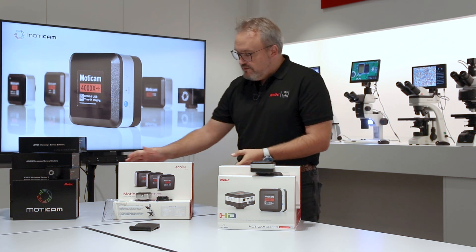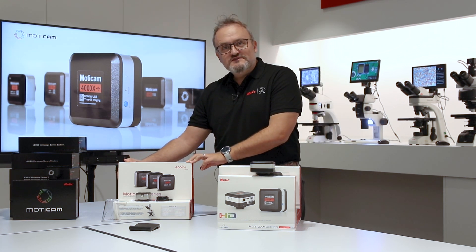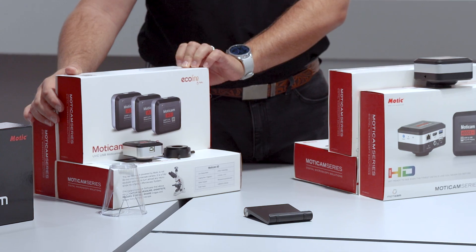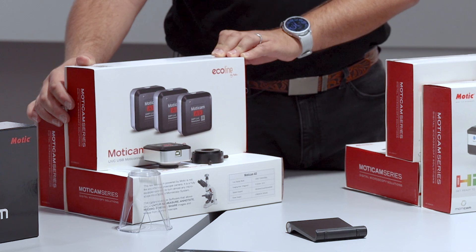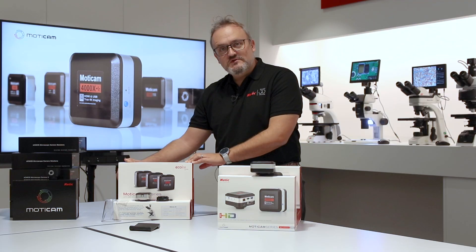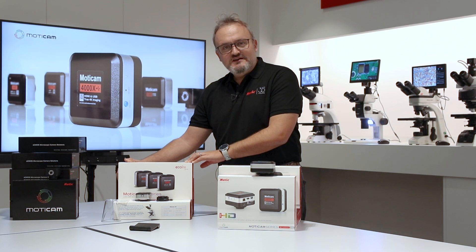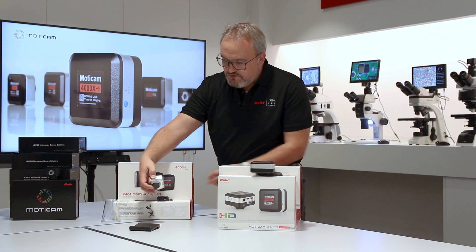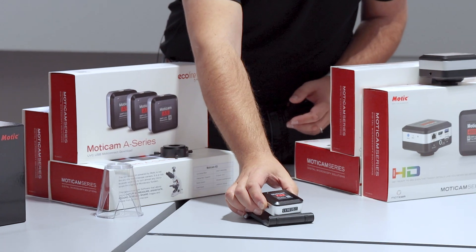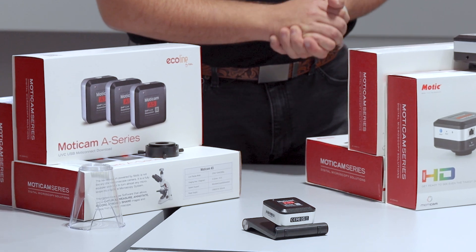Next we move up to the multiple attachment category. These are the Moticam A-Line solutions, whereby we offer you small footprint cameras to attach virtually any microscope to a camera and turn virtually any old microscope into a digital microscope. Here we have one of the Moticam A-Line cameras. These are USB output, and most computers have USB.